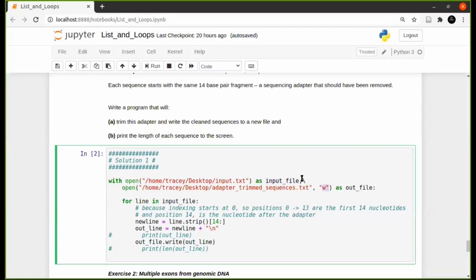Then I use this escape character so that it looks a bit more readable and neat, because I can add this section to a new line. But this is actually one line. So you can do that as well.